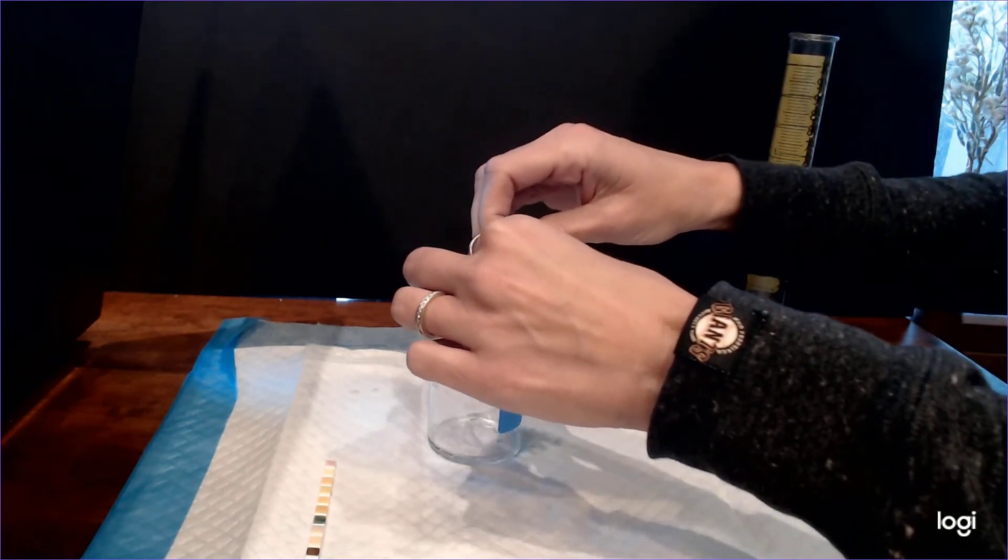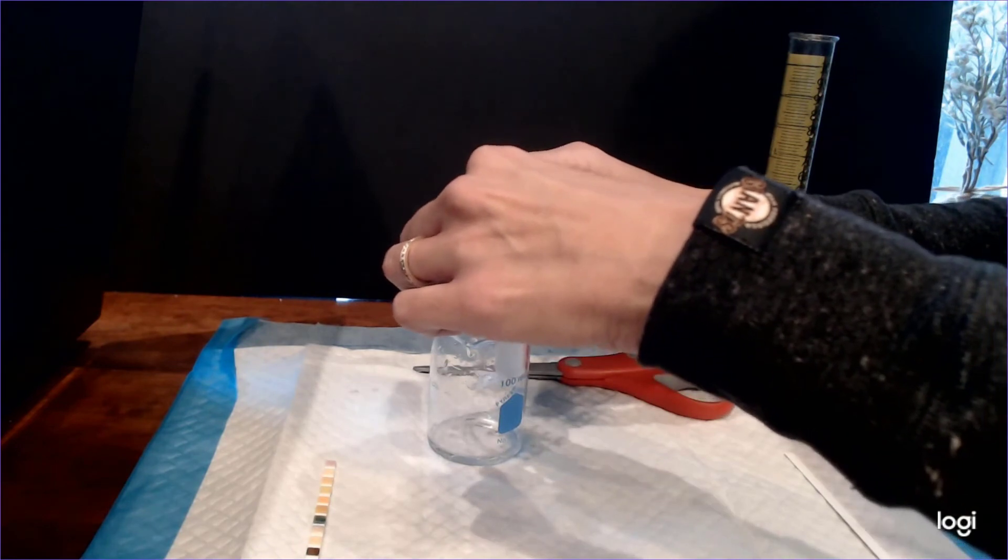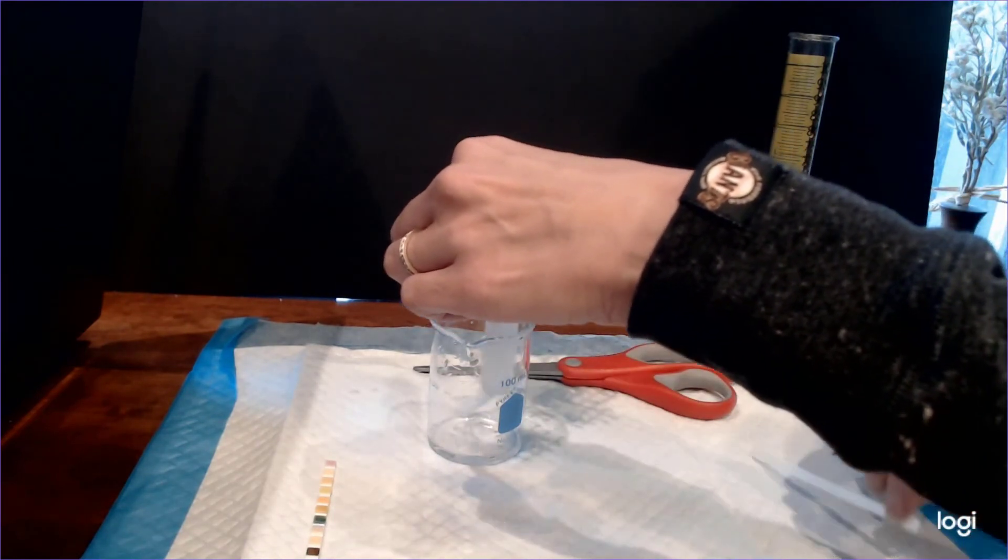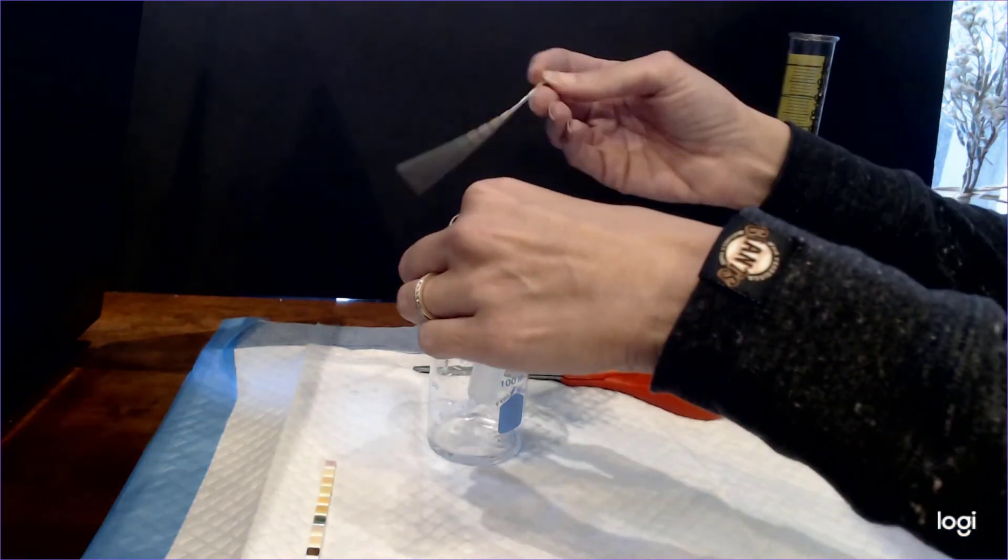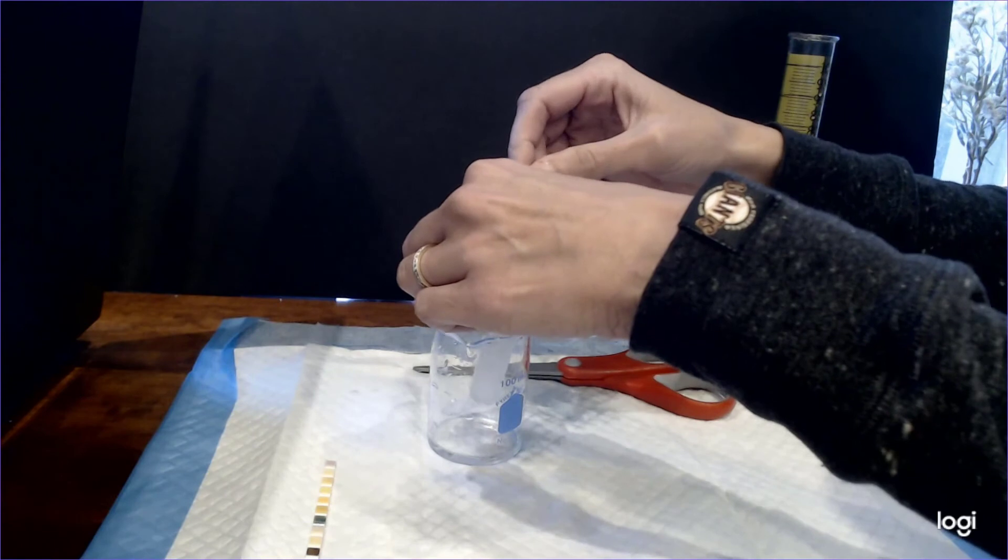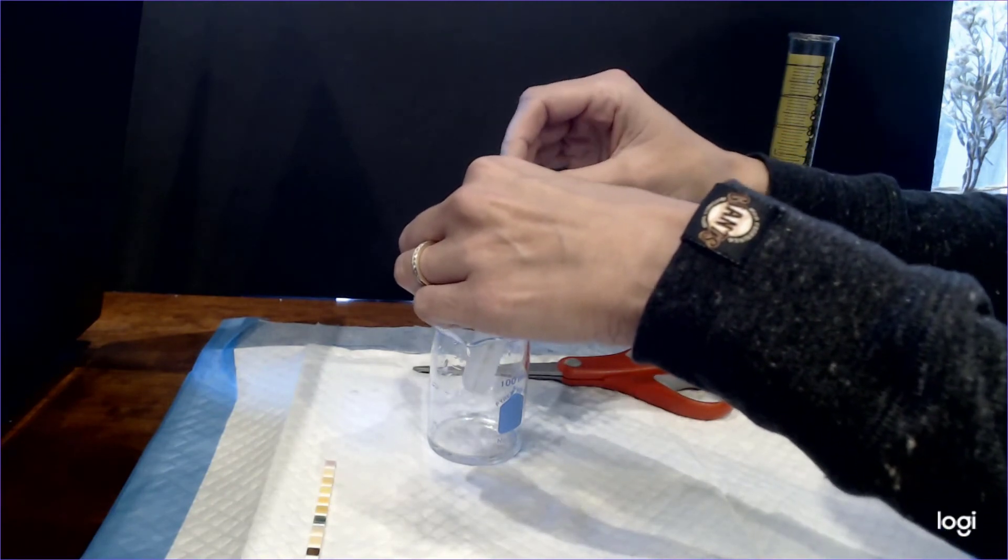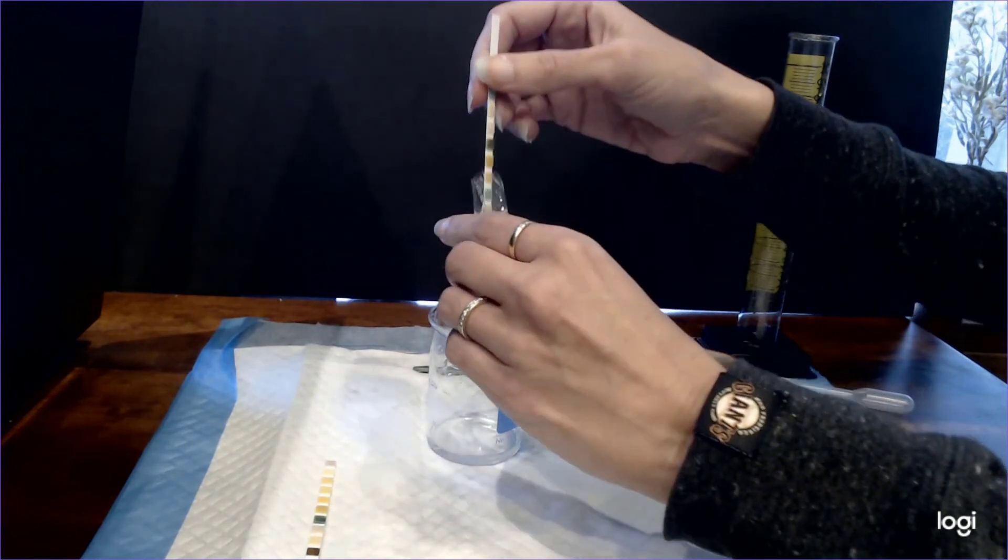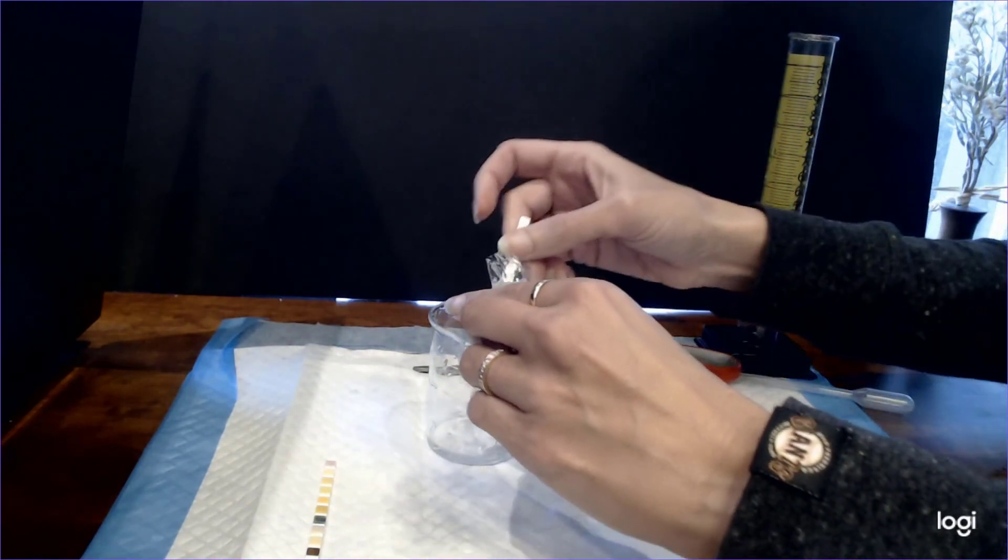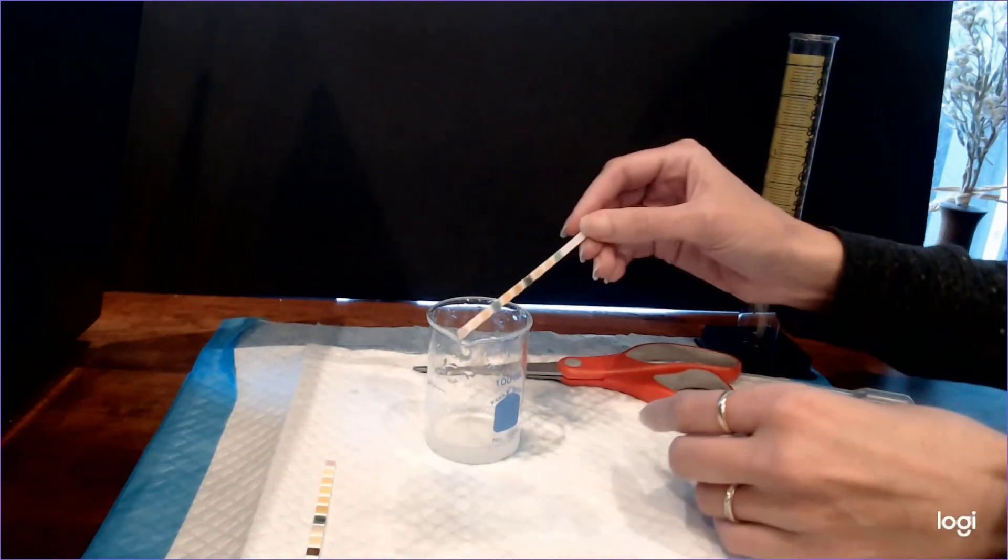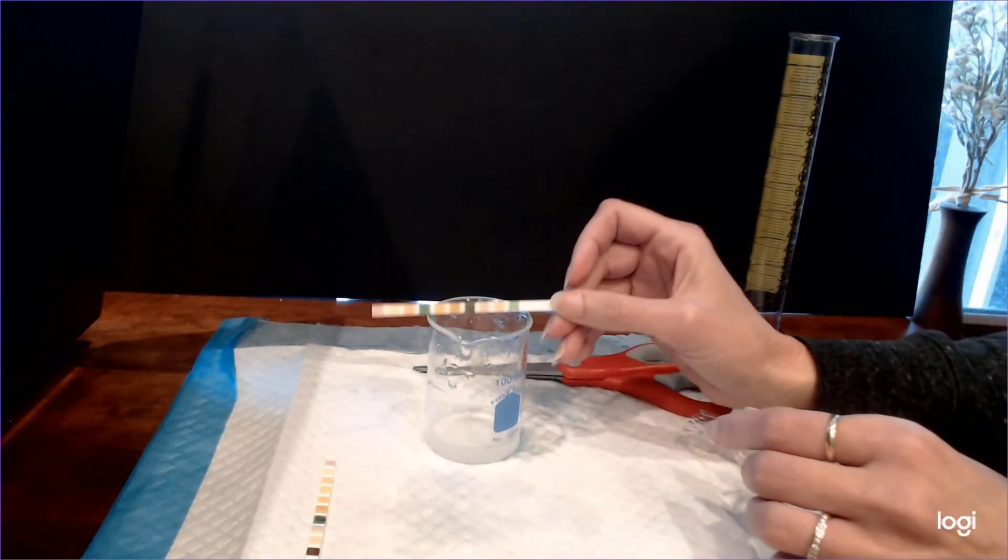So I went ahead and just used scissors to kind of cut off the very top, get a little bit of an explosion there so you might want to do it over your beaker. And then you're going to go ahead and take your dipstick and dip it in the dialysis bag. Now it might be difficult to actually submerge all of the pads in the dialysis bag, so one thing that you can do is you can use your plastic pipette and just kind of squirt some of the solution over, or in my case what I did is I just kind of dumped it over the multi-stick.